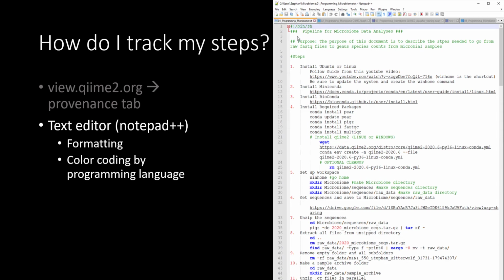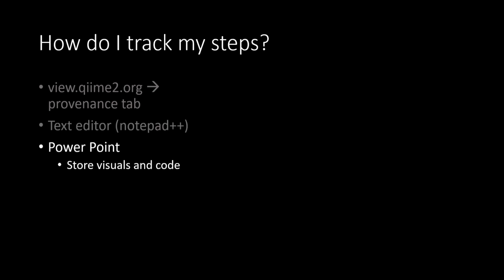And so here I've got the steps or the pipeline for the microbiome data analysis that I did over the summer, from installing Linux to going and unzipping all the files and doing certain cleanup steps. And so this is a good option. Notepad++, highly recommended. It's a free software and it doesn't really take a lot of space in your computer.